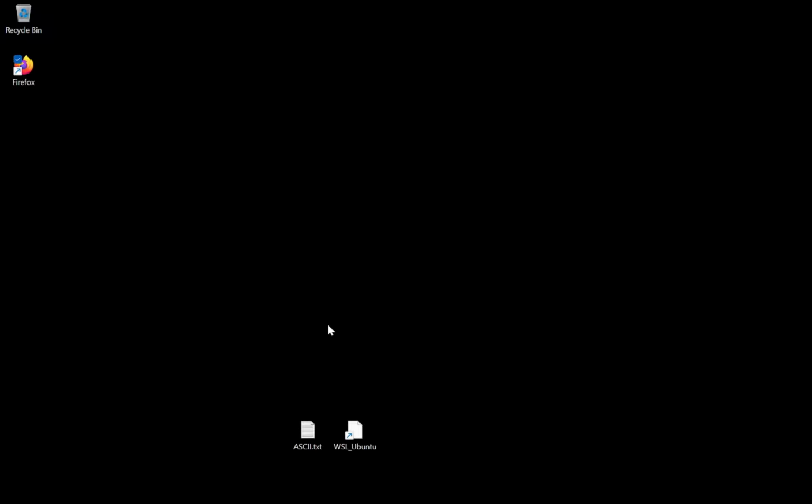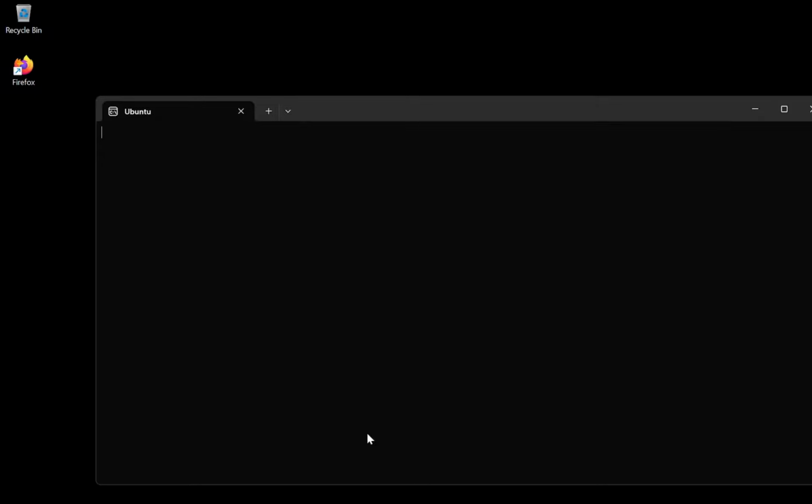If you can't find the exact run, don't worry. I've included a text file with the SRR number for you to download. So we are going to use prefetch from SRA Toolkit to obtain the SRR. So we are going to open the terminal. In this case it is the Windows Subsystem for Linux.